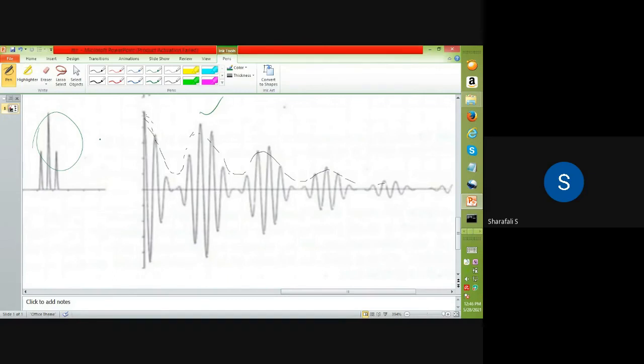We get a complicated spectrum. You can see that the maximum will always be at the initial position, then the intensity gets reduced because of the interference that is happening, because the maxima and minima will be at different positions. Then we have to add up all those points, and we'll get a complex spectrum. From there onwards, we'll get different maxima and minima positions, but the overall shape will be like a cosine wave.